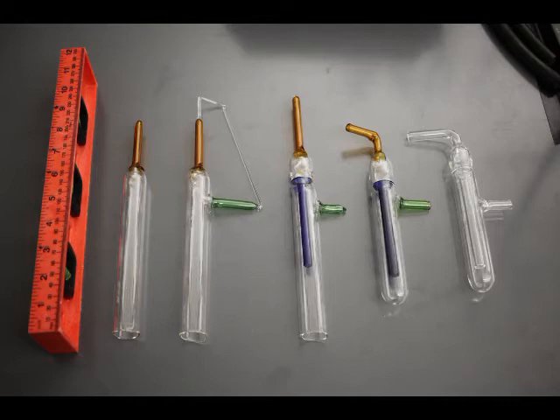Going from just the raw pieces of tubing to the final product of the bubbler is very doable, but it takes practice. And what I would recommend if you wanted to tackle a project like this, do each one of the steps multiple times till you feel comfortable with it. In other words, make a butt seal, make 10 of them. Then make a side seal, make 10 of them. Bridge up those two seals and then repair them and go from there, or clean them up. Make lots of attempts at the ring seal as well.